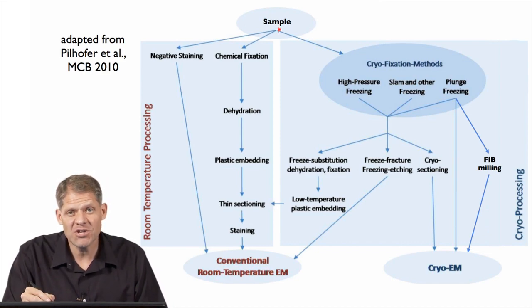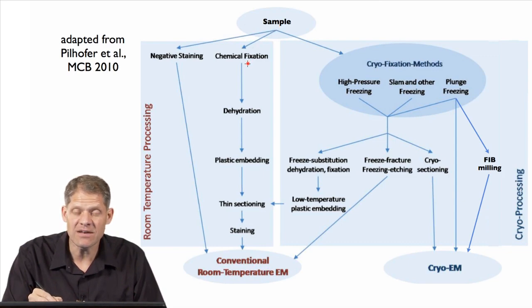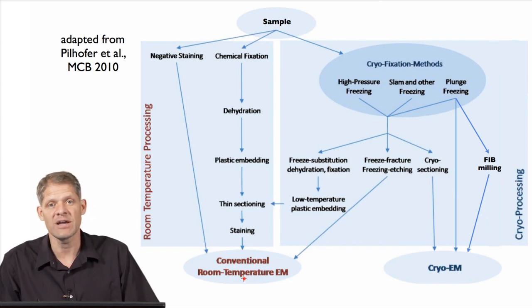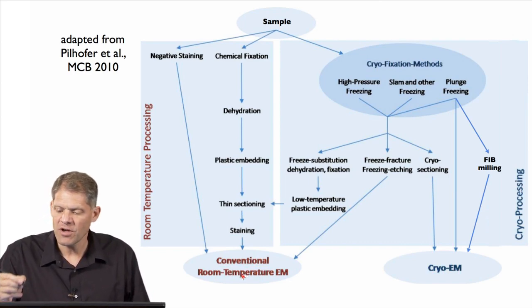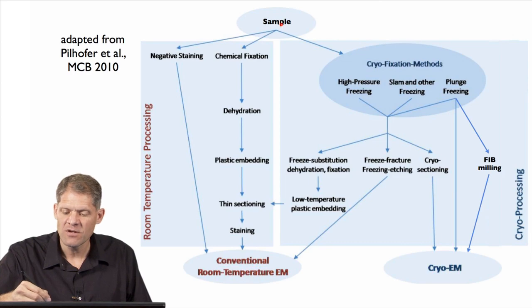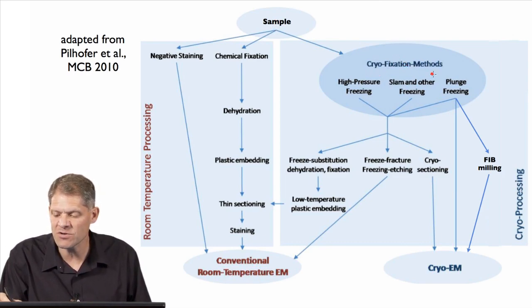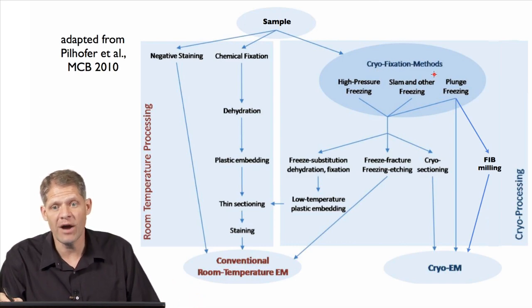Traditional thin section EM proceeds by taking a sample and chemically fixing it, and then dehydrating it, plastic embedding, thin sectioning, staining, and then you can stick it in the electron microscope. The cryo methods begin with the sample, and then there's some kind of cryofixation that is used. There's a lot of different kinds of cryofixation.